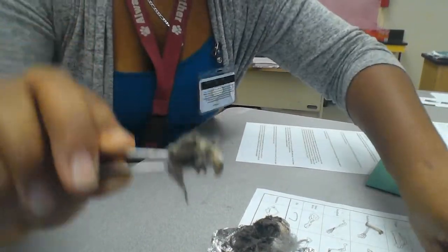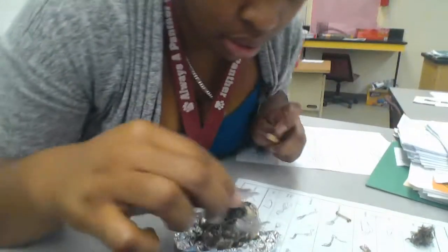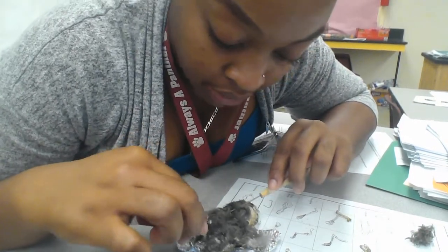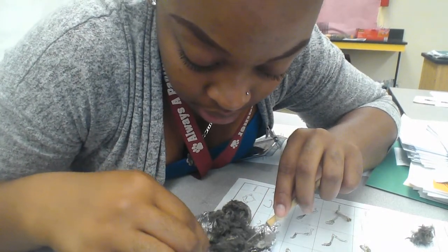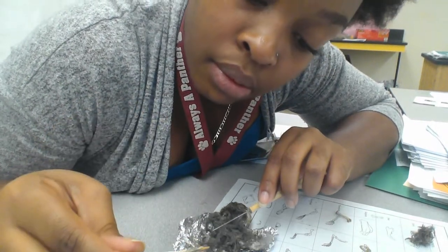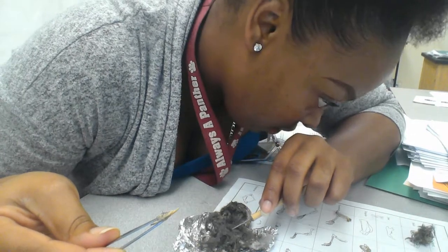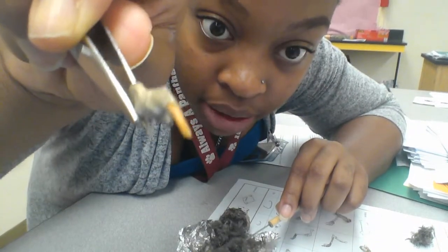Yeah. So, looking at this, like I mentioned, this definitely would go for a rodent skull. Look at the long teeth, rodent skull. Definitely. I think I found, is that another part of its face? Actually, I think this is another rodent skull. This is like half of it. This is the same long yellow teeth. So we found another rodent skull.